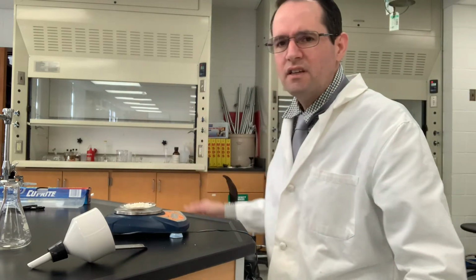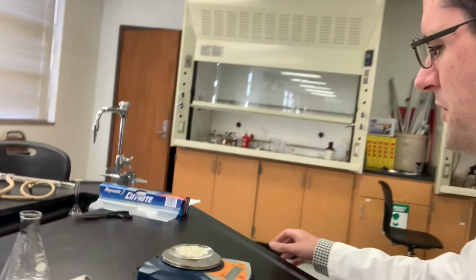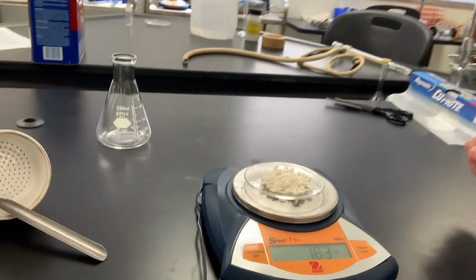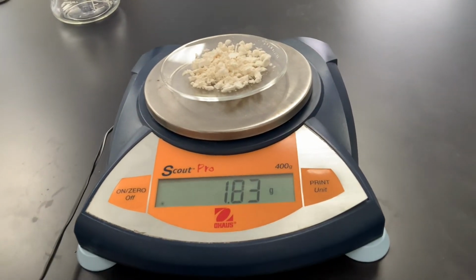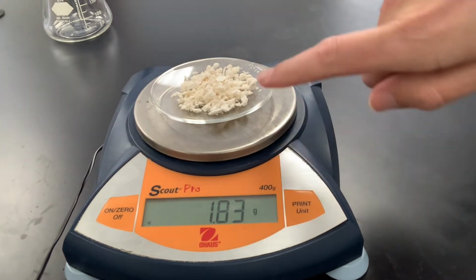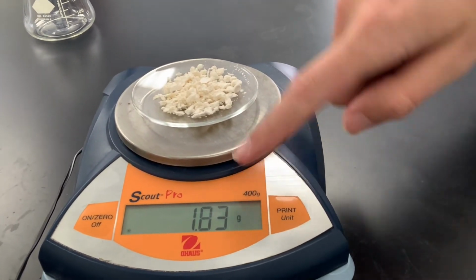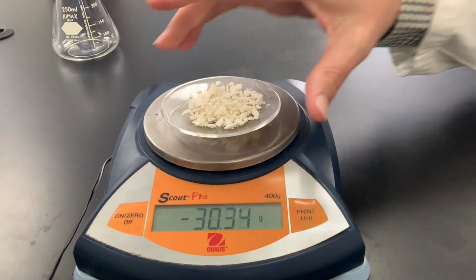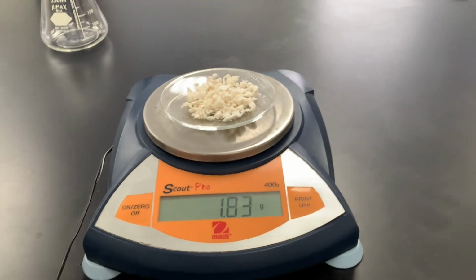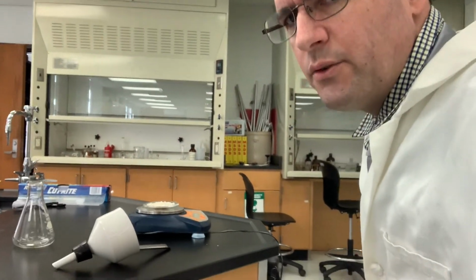So let's bring the camera around, and there's our mass. Okay. Seems quite high in my mind. I don't remember what we started with, but there's a lot of water here, so we're gonna come back on Thursday. You know, I'll just put this off to the, well, I need to keep this on there, don't I? We'll come back Thursday and we'll see what the final reading is.